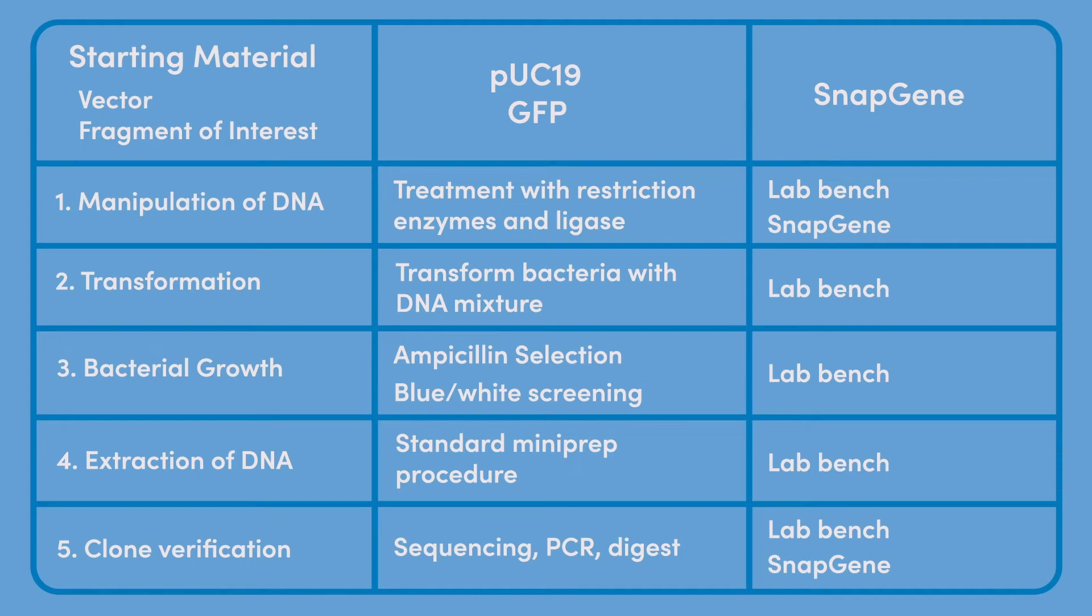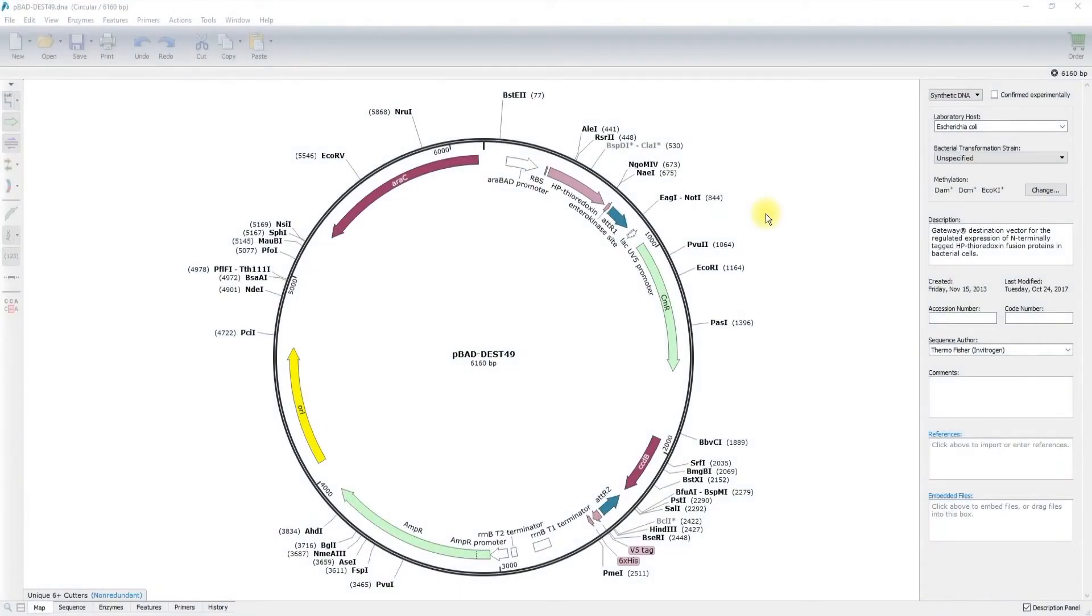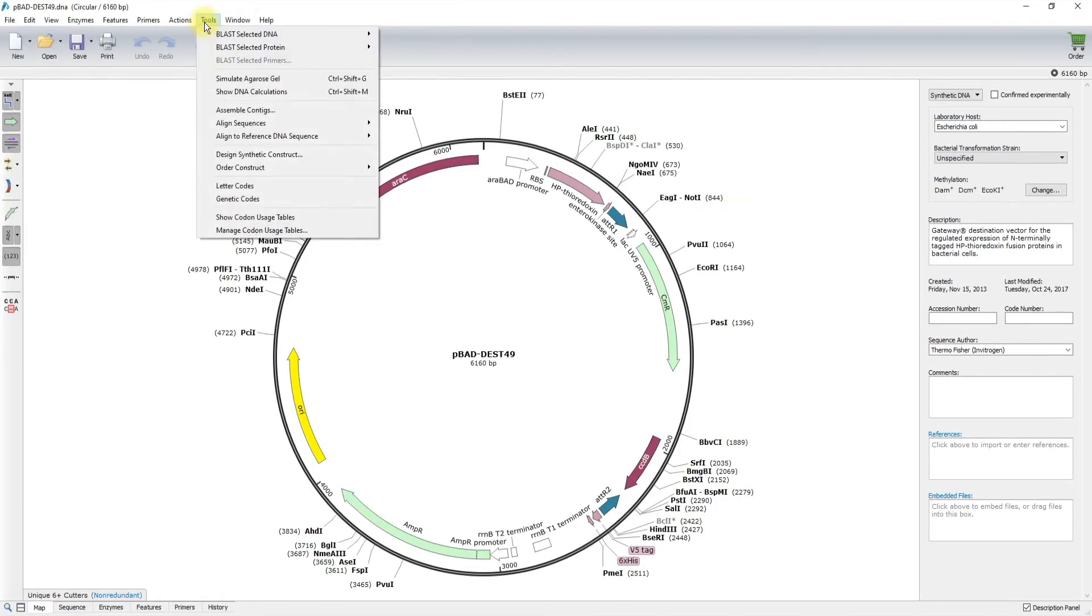As you move on to clone verification, the functions found in SnapGene tools now become essential. As you proceed with clone verification, you will find the tools found under the Tools drop-down menu to be of great use.